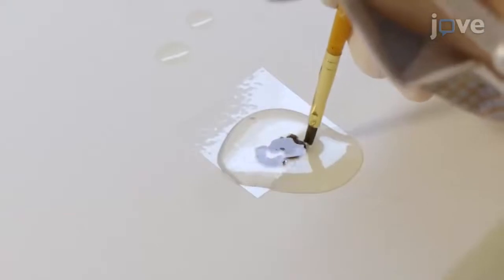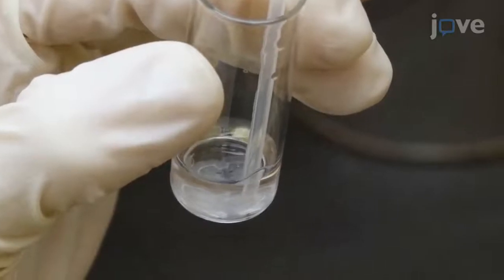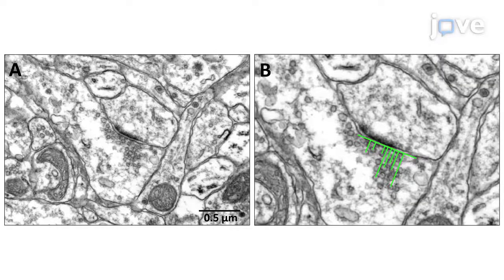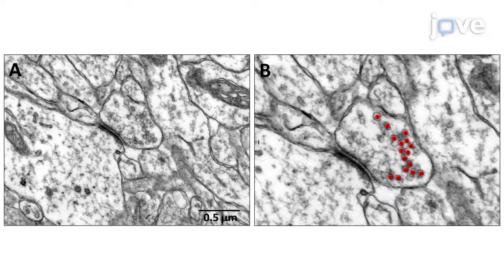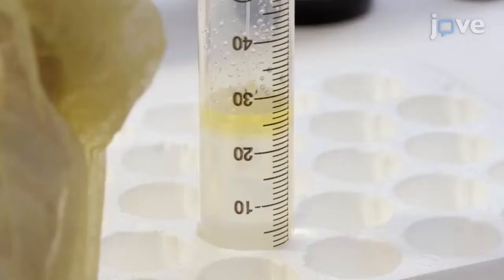Among several existing protocols for tissue preparation for transmission electron microscopy, we selected methods that yield optimal structural preservation and high-resolution micrographs to perform morphometric analysis of synaptic vesicles distribution at presynaptic terminals. The high-contrast images obtained with these methods allow us to quantify parameters such as distance of synaptic vesicles from the presynaptic membrane, number of vesicles docked at the presynaptic membrane, and intervesicle distances.